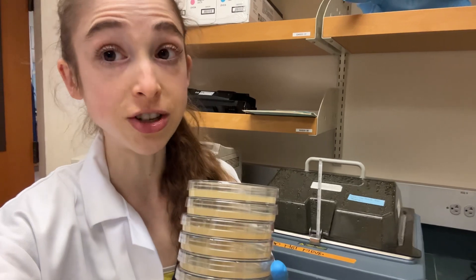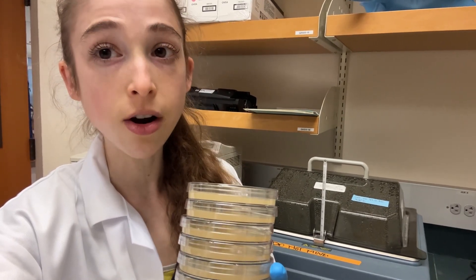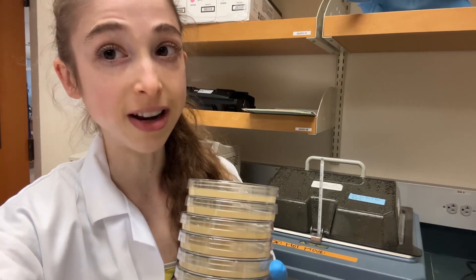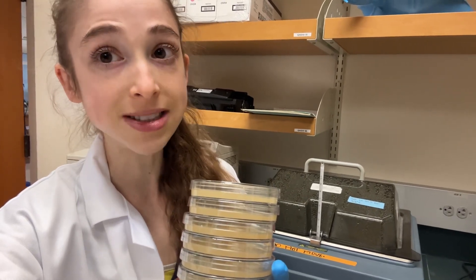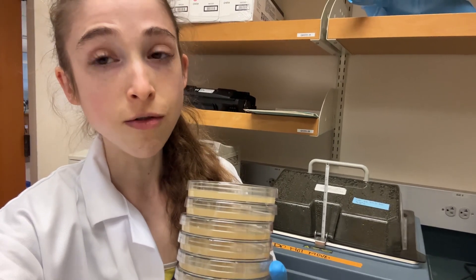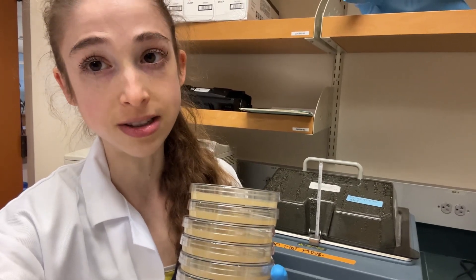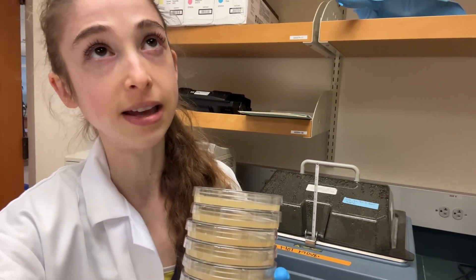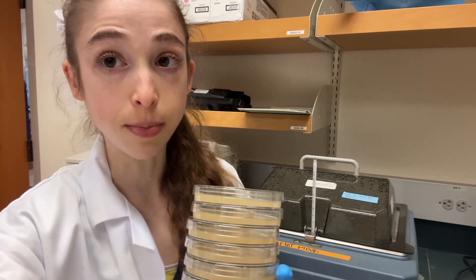Another helpful tip for actually mixing those antibiotics is to autoclave the LB agar with the stir bar in there. Don't worry, it'll be safe in the autoclave. When you add your antibiotic, you can then use a magnetic stir plate to mix it up rather than trying to swirl or shake it, which is likely to introduce bubbles — and you don't want bubbles on your plate making you wonder: is that a colony or is that a bubble? So autoclave it with the stir bar in it.